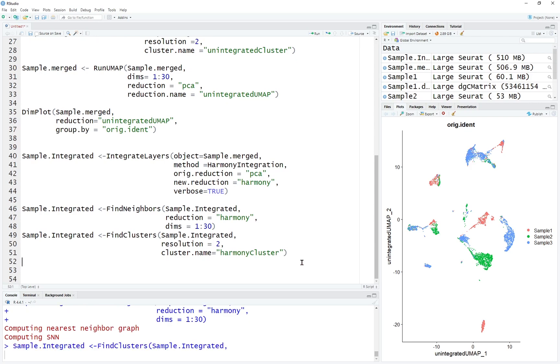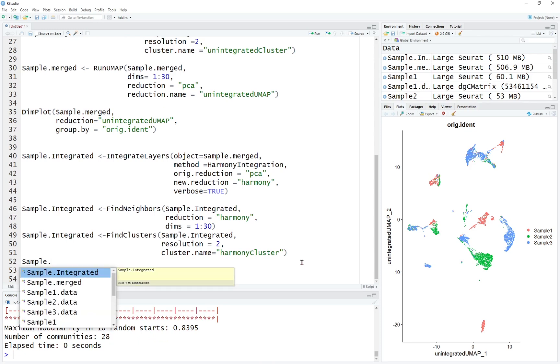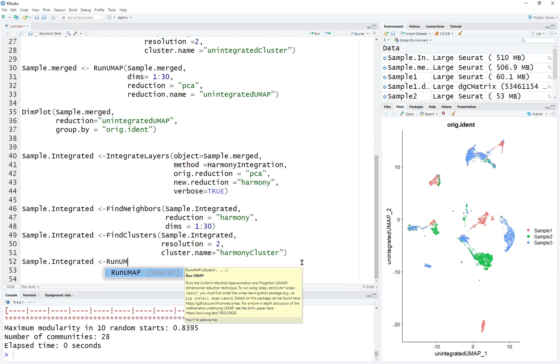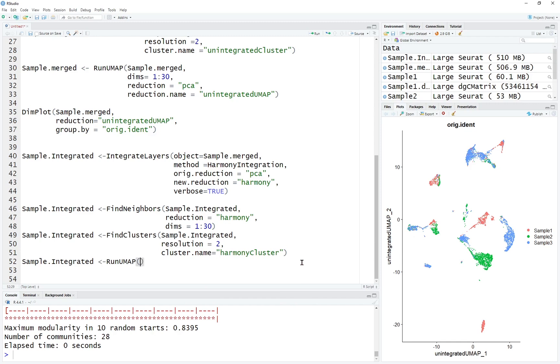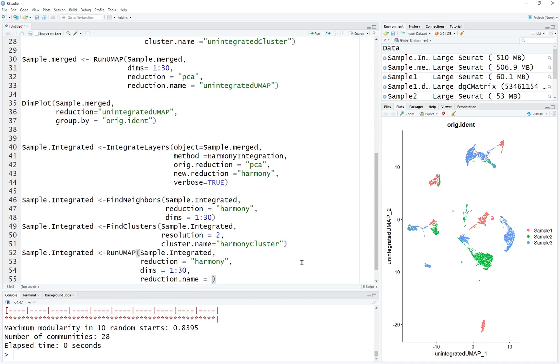Let's run FindClusters. After that, we're going to run RunUMAP on sample integrated. The reduction is going to be harmony, the same harmony. The dimensions are 1 to 30, and the reduction name is going to be harmony UMAP.